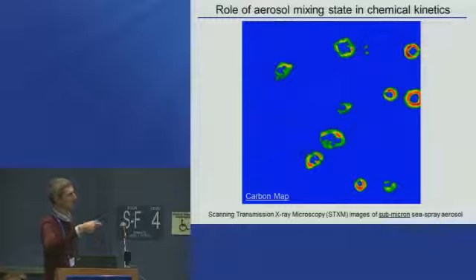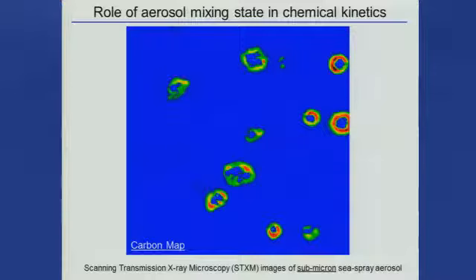And I know my title slide has some things about X-rays, but we're not going to talk about X-rays today. This is really just an image that follows up nicely on what Lex just presented. This is a carbon map. This was from Ryan Moffat and also some work done by Andy Andre, looking at the individual sea spray particles.